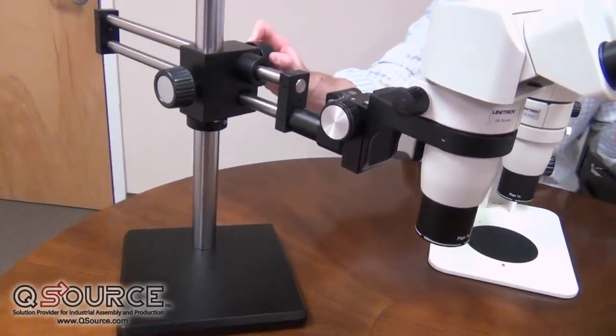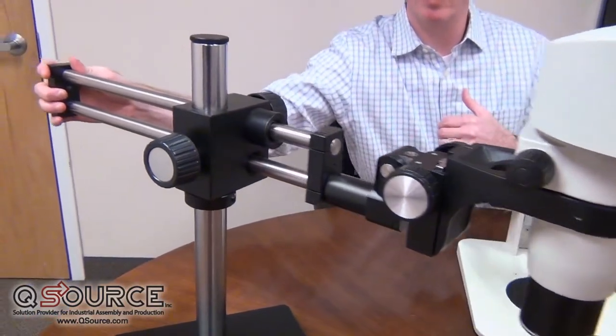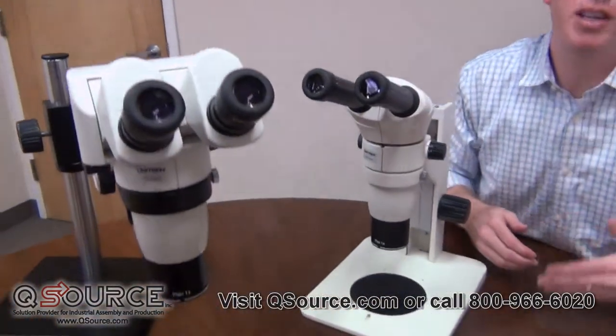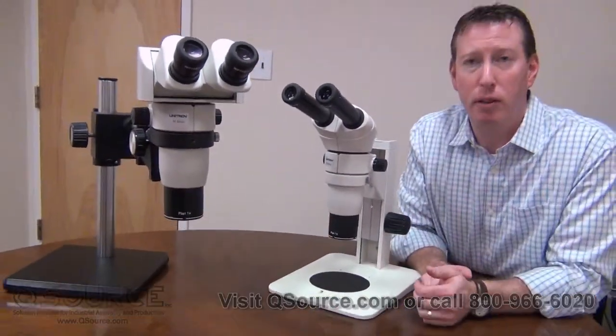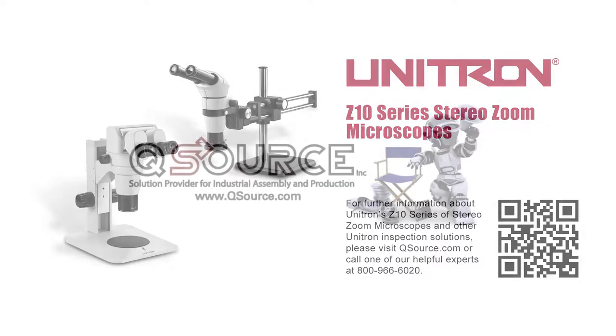You can move it in and out depending on your needs simply and easily. Other options still include articulating arms and flex arms, but you can contact your local QSource representative to find more details on that. Stay tuned!